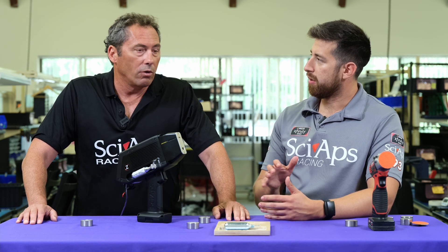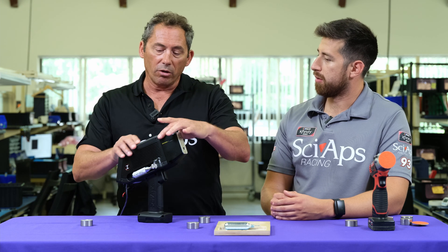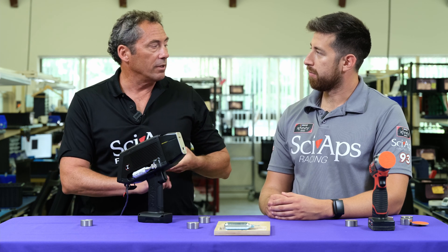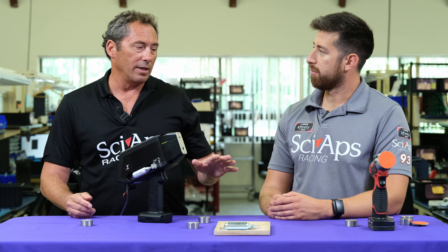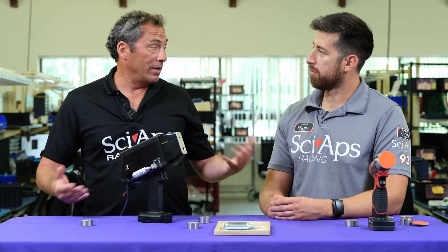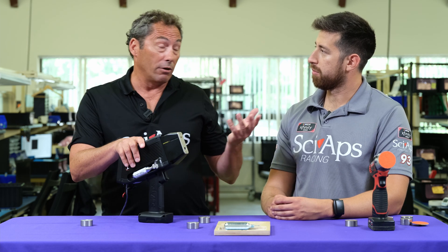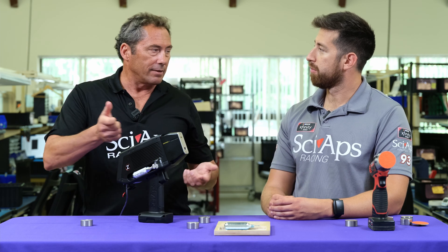And if they only need to measure carbon? We've come out with another unit — let's call it the sister to this unit. It's called the CSI. CSI stands for carbon silicon. It's a smaller unit — this one is only about four pounds, but the CSI is only about three and a half pounds. It only measures carbon and silicon. The reason we came out with that is because there are a lot of people with X-ray guns out there. X-ray does great on nickel, chromium, manganese, and all those other elements. But sometimes they have to do carbon, and the X-ray doesn't. So instead of buying a fully loaded carbon unit, save about $10,000 or $12,000 with a carbon-only unit. They go out with their X-ray to shoot, and if they need carbon, they take the CSI unit and shoot it for carbon.